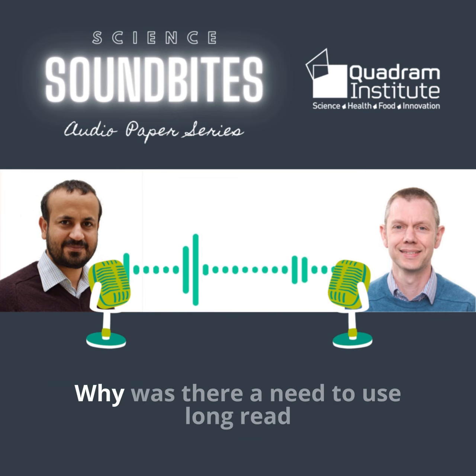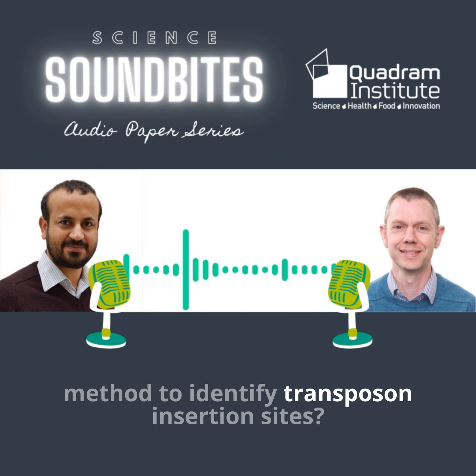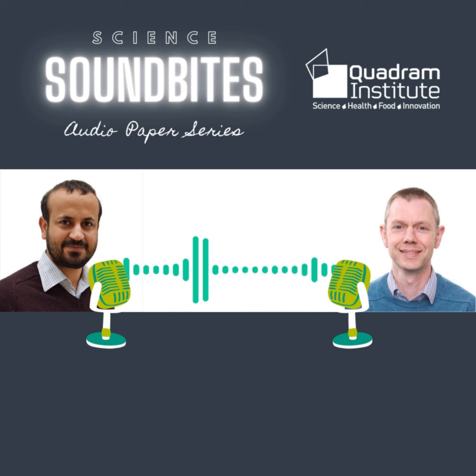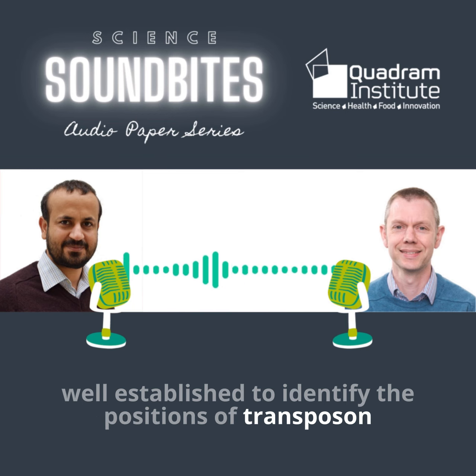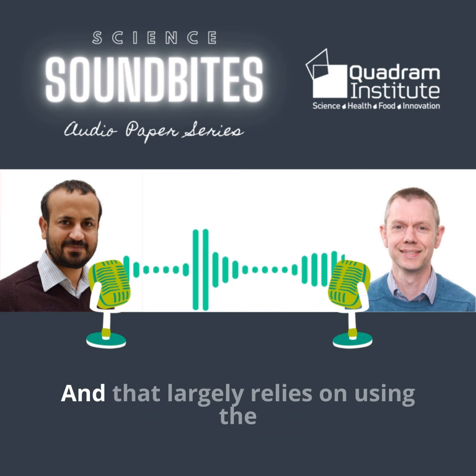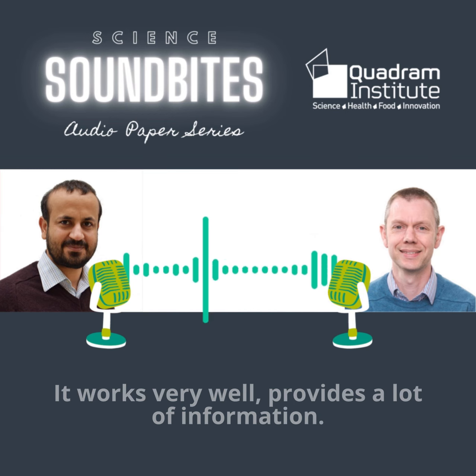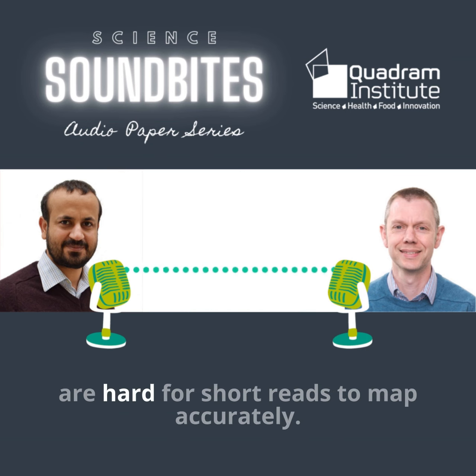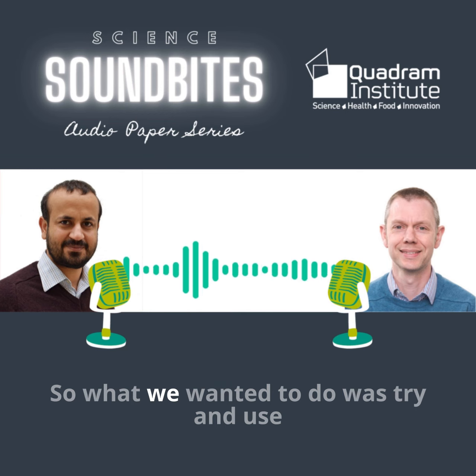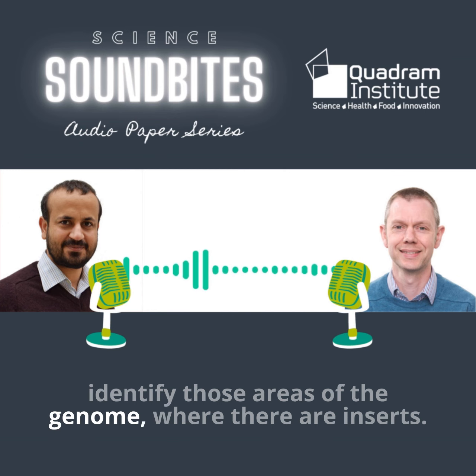Why was there a need to use long-read sequencing to identify insertion sites, as there's already a method to identify transposon insertion sites? So, as you say, the current methodology is well established to identify the positions of transposon inserts in the mutant library, and that largely relies on using the Illumina platform, which provides short reads. And that works very well, provides a lot of information. However, there are some bits of the genome which are hard for short reads to map accurately. So what we wanted to do was try and use some long read technology to get us the ability to identify those areas of the genome where there are inserts.